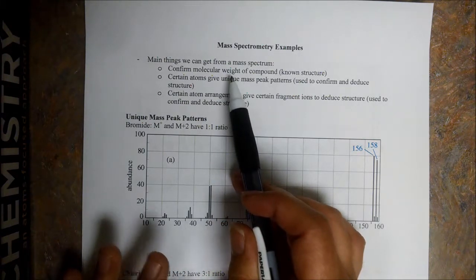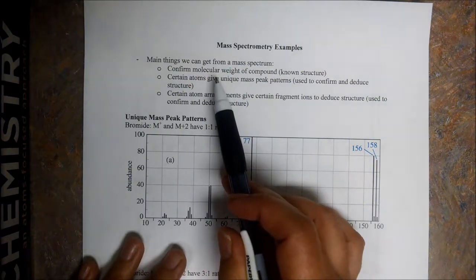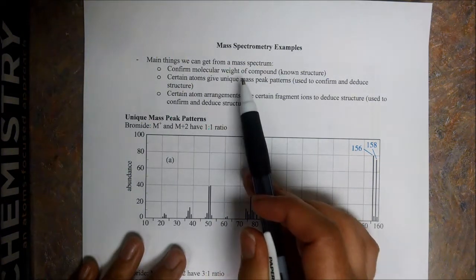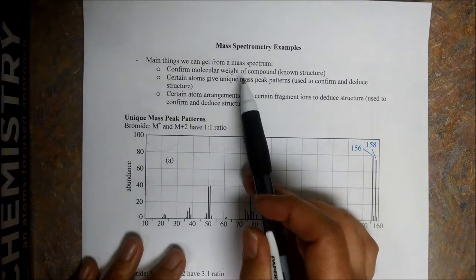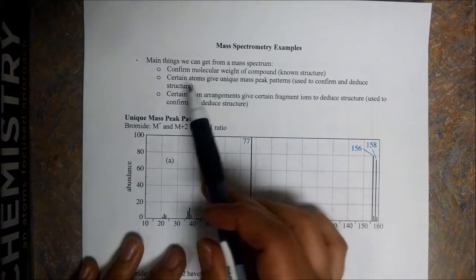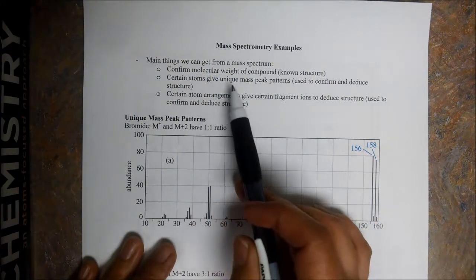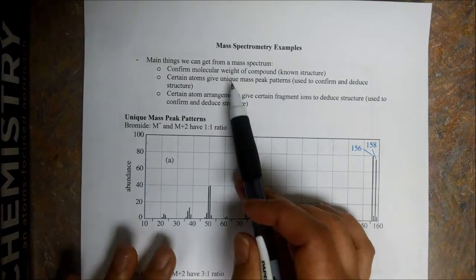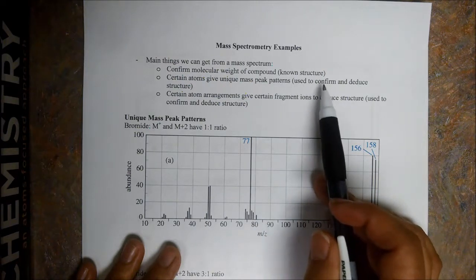When you publish a paper, you have to publish it with its mass spectral data, because if you use a big old mass spec, you can actually confirm the molecular weight to 6 decimal places of accuracy. So this can be very useful. Certain atoms give unique mass peak patterns, okay? This is unique to certain things in a molecule, and so if these certain peak patterns are present, we can use them again to confirm the structure, okay?